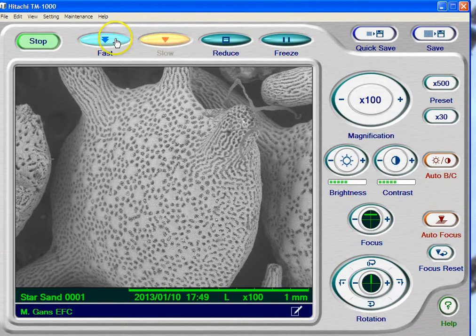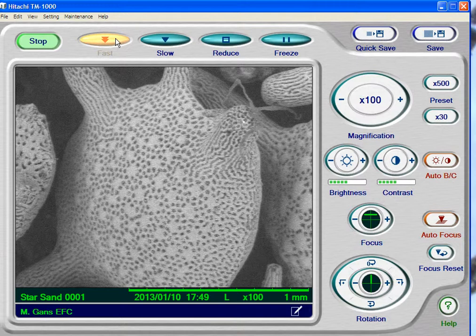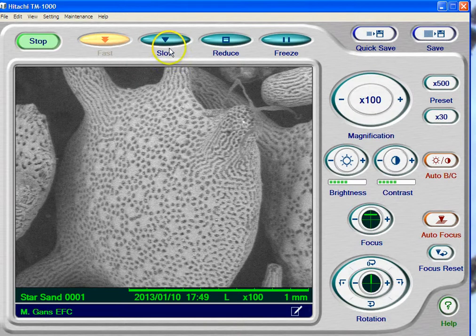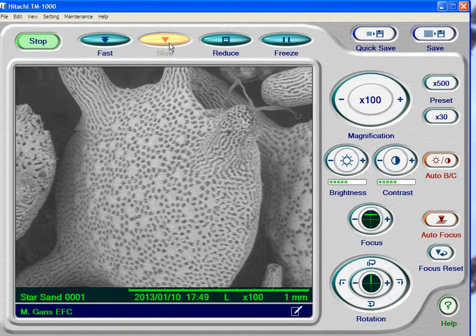So on a fast scan, which is, as it says, fast, the quality is grainy — and this is called noise. Slow scan gives much higher quality.